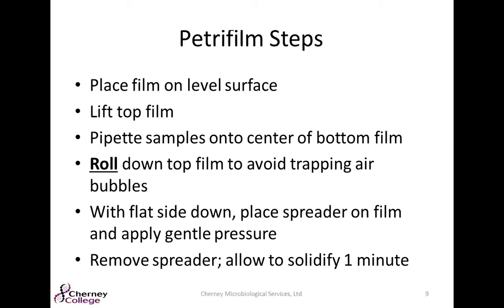With the flat side down, place the spreader on the film and then gently apply pressure in the center of the spreader. Make sure at this point you're not sliding the spreader around. You just want to keep it in one place and apply that gentle pressure. Then you'll remove the spreader and allow that gel agent that I talked about in the beginning to solidify for 1 minute.